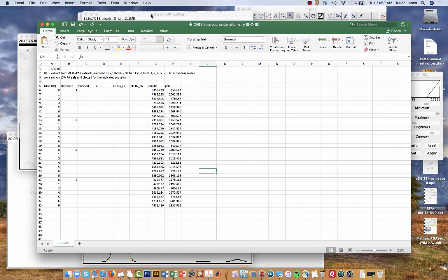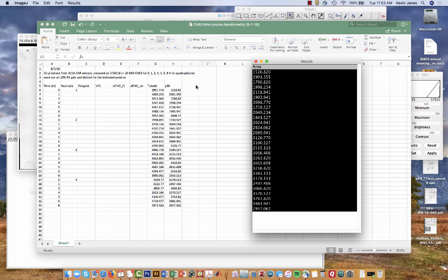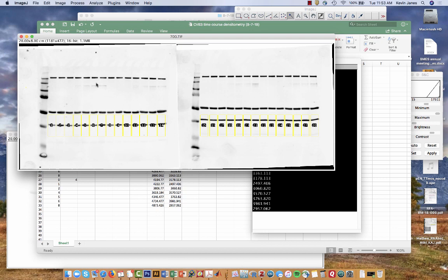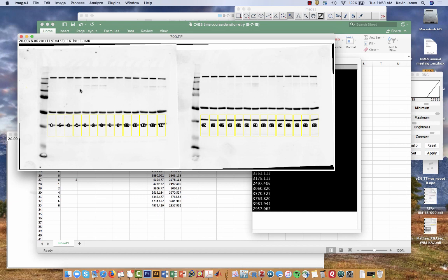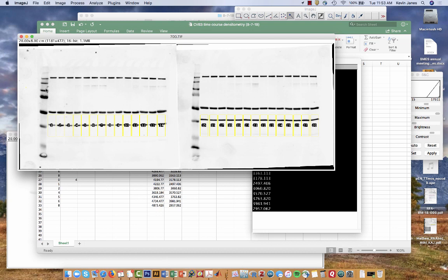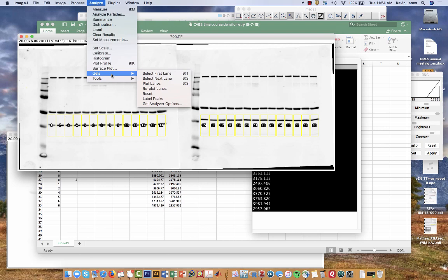For the last thing, I'll close this and I want to show the EIF4G blot. As I mentioned before, we have two bands of interest. We have the full-length EIF4G up on the top, and then this triplet of cleavage products that you can see maybe 100 kilodaltons down. I want to capture both of these, and I want to capture them relative to one another, meaning that I need to do the densitometry on both concurrently. This one is a little bit more involved, but I'll show you how we can get it done.